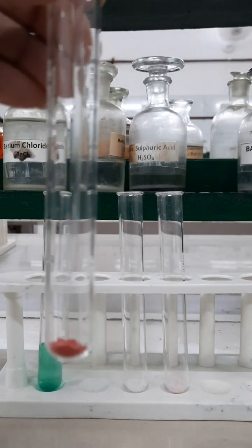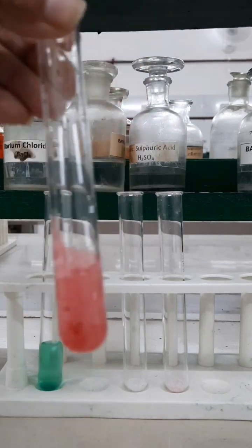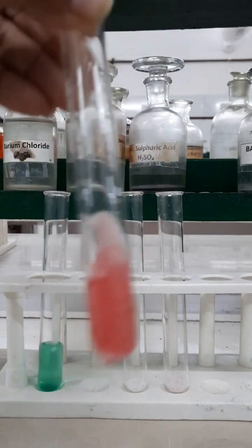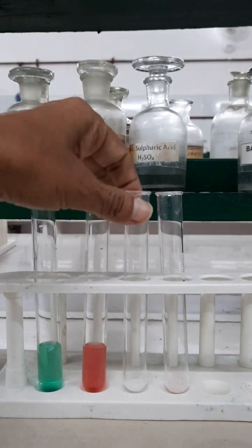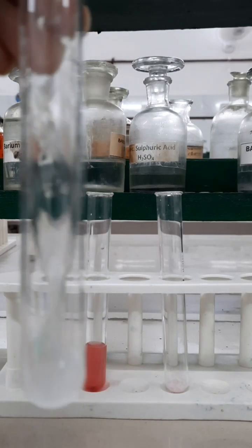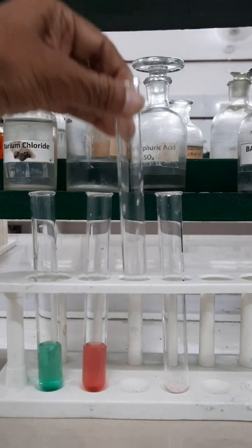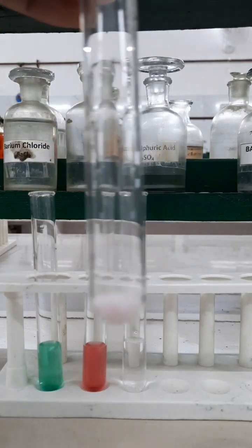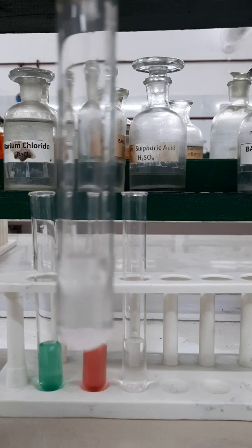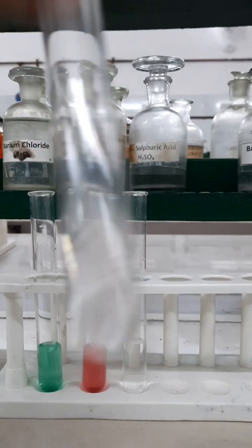Now this test tube contains cobalt acetate salt and I am adding distilled water to prepare an aqueous solution of it. In the third test tube, zinc sulfate salt is taken and I am adding distilled water to prepare an aqueous solution of zinc sulfate. Now in the fourth test tube I have taken manganese chloride salt and I am adding distilled water to prepare an aqueous solution of the salt.